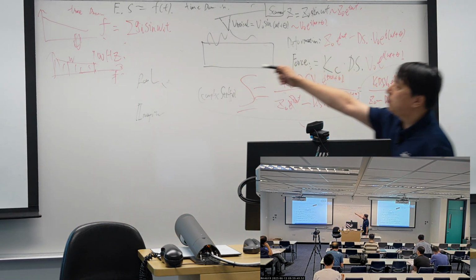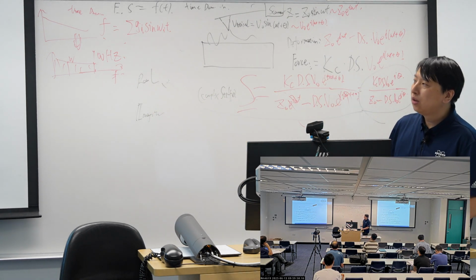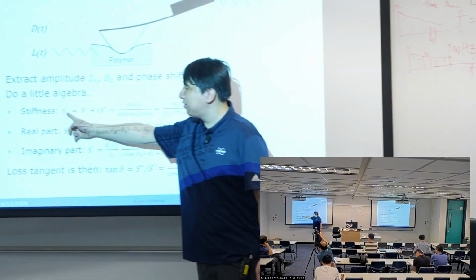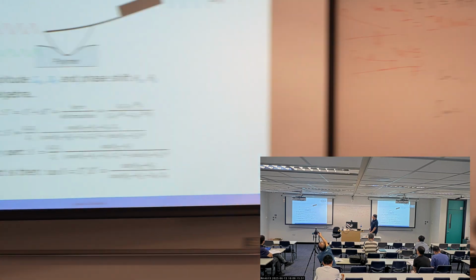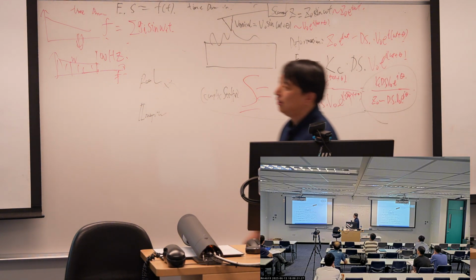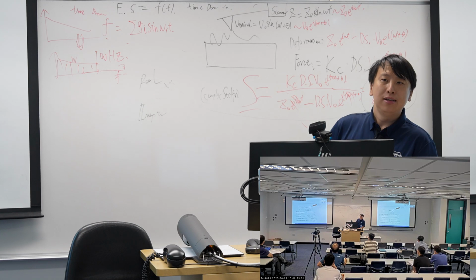So we have the real stiffness and the imaginary stiffness, and Bruker calls them the so-called storage stiffness and loss stiffness, but nobody else calls them that. It's just Bruker, because Bruker used this way to get the stiffness out and then the Hertz model, so we have the stiffness out, and then we can get our modulus later. So that's how Bruker processes this number.